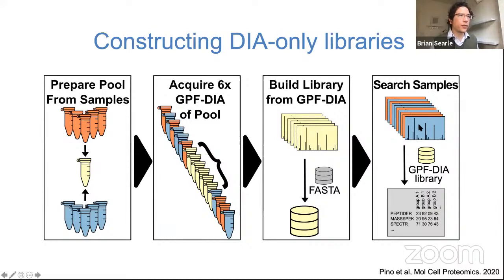Charlie Yang asked a question about IRT peptides. IRT peptides are just a trademarked peptide type that fit within an index retention time. These are peptides produced by a specific company, Biognosys, so they're sold by that company, and that's fine. But any type of peptide works here. Pure retention time standards, PRTCs, are essentially the same thing.